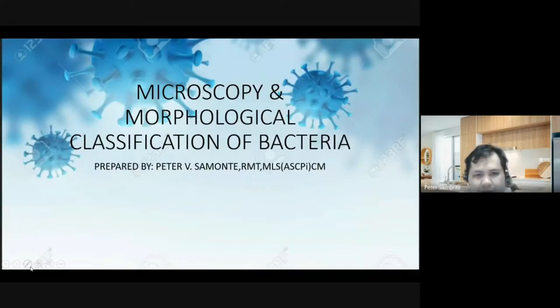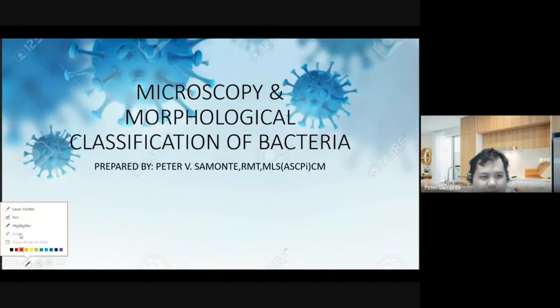Module 2, we'll be tackling your Module 2, microscopy, and morphological classification of your bacteria. Since you entered college, even if you were part of your senior high, you've been dealing with microscopes. So let's tackle them a bit.